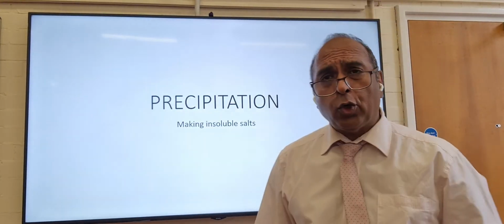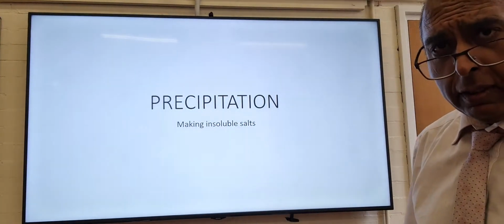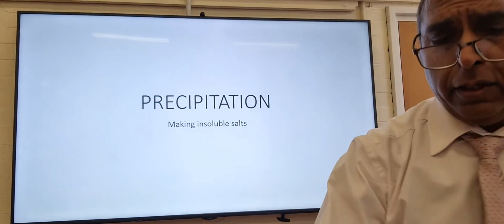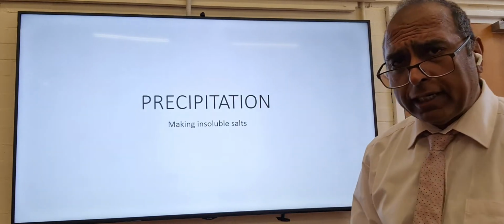Precipitation as a way of making salts, and ionic equations. That's what I'm hoping this lesson will be about, following on from the acids, bases and salts lesson I gave last time.